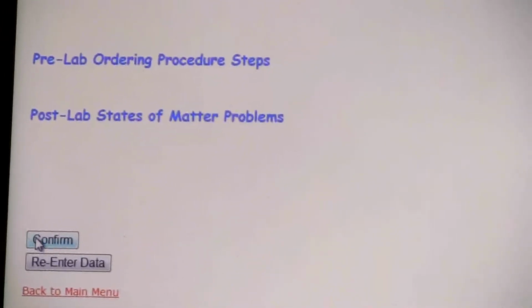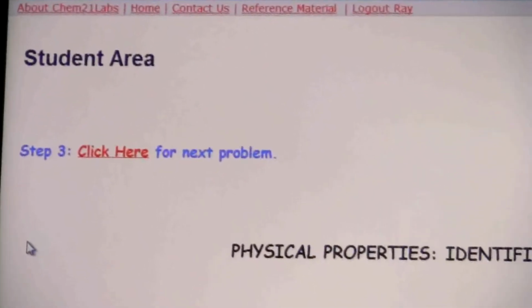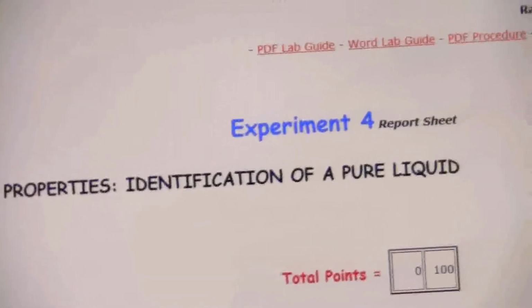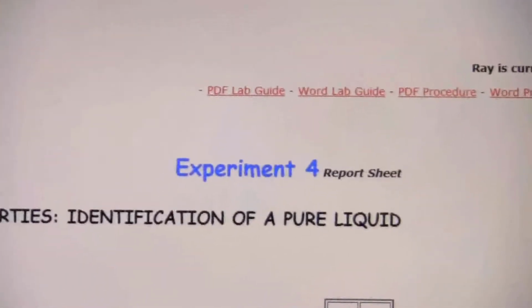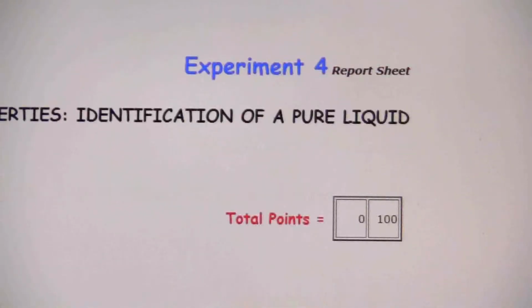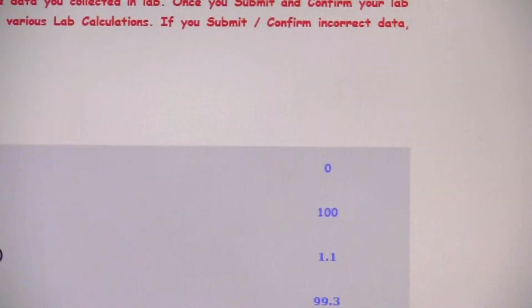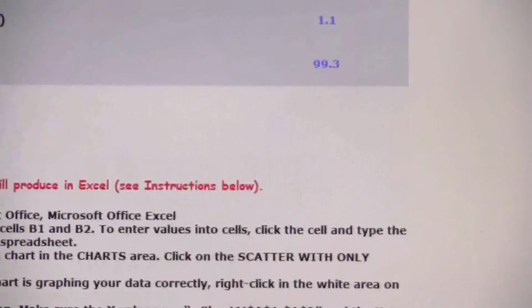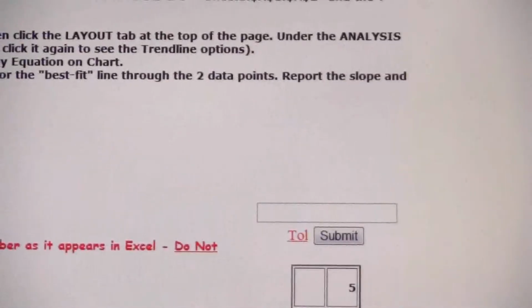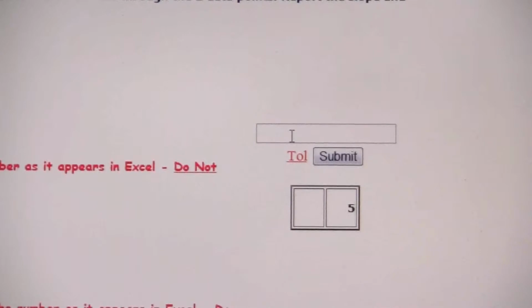But once I click confirm, then the instructor, that's me, has to go back, and if there's a problem, I have to go back and clear it out. So it's just extra time and hassle. So you want to make sure that all of your data is correct before you click that confirm. Okay? So now we go back and we've confirmed that data, and we look here, and you'll notice now it's opened up a field for us to enter some of those ones that say enter later.